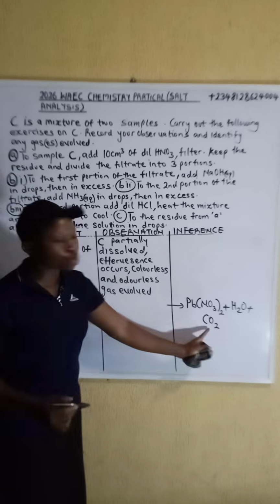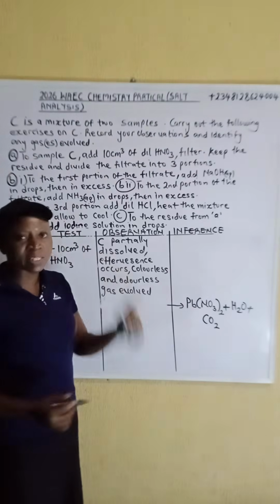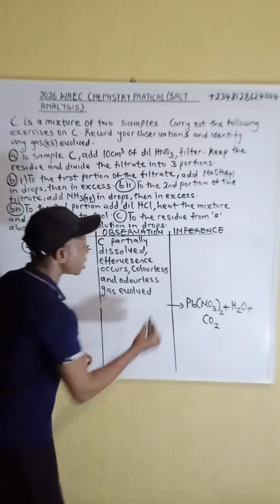Now to confirm the presence of carbon(IV) oxide, the gas will be tested with lime water.